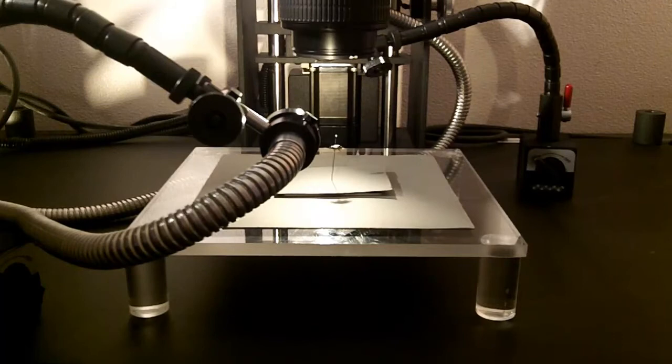So here I can obtain different kinds of detail that I want to be highlighted in the specimen. Here we can see a test shot of the same specimen with the same exact lighting but without the fiber optic cables. And as you zoom in you can get a lot less.